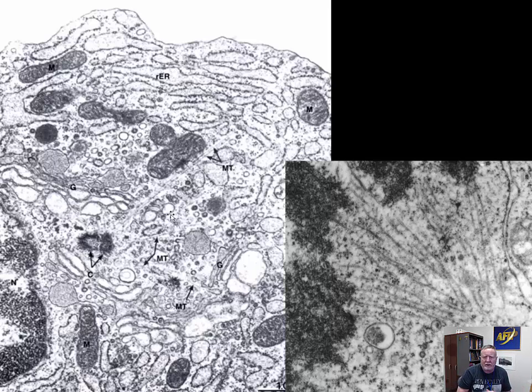Mitochondria may be in highest concentration in the areas of the cells that have the highest requirement for energy, such as near the basement membrane in tubular epithelial cells. So something has to get them there. They're just not floating free. We have this picture in our head of cells being just a big bag, and it's really not like that. There is function and structure and directed motion of organelles.